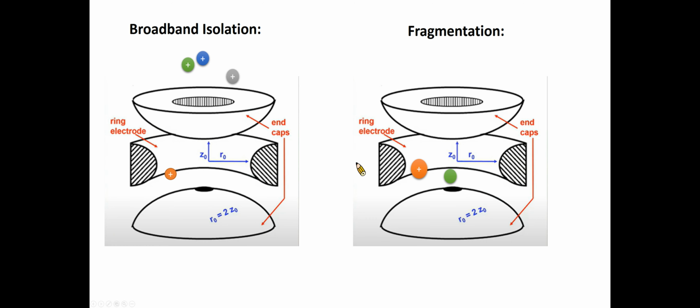Fragmentation. As ions move away from the center of the trap, they pick up kinetic energy. In the event that they subsequently collide with a neutral, there is an elevated amount of energy which can be converted into internal energy. If enough of these collisions occur, the ions can attain a sufficient internal energy to actually break bonds, resulting in fragmentation.